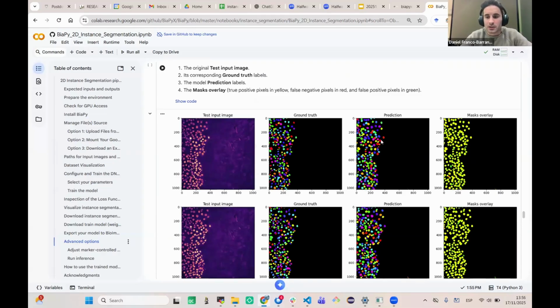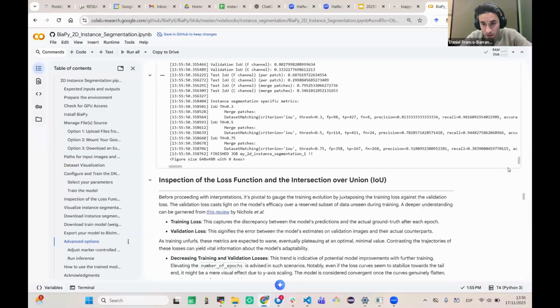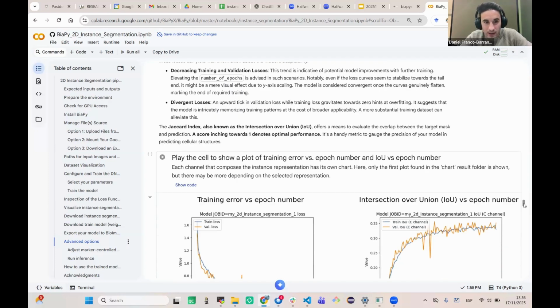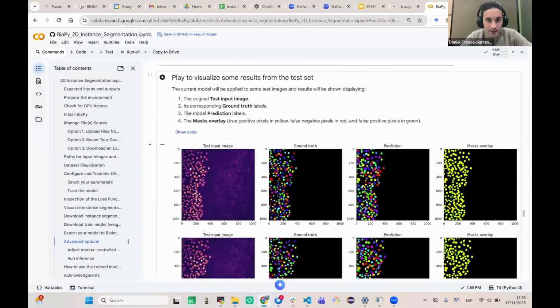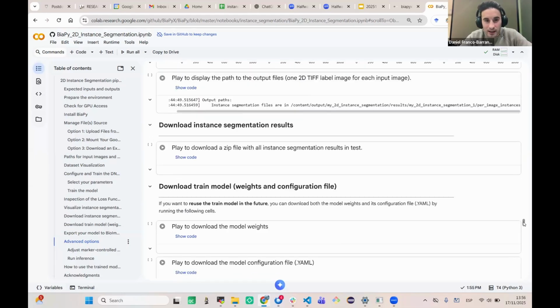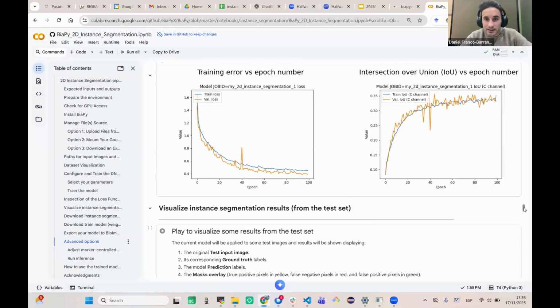So with these last minutes that I have, hopefully, if you were following me, you will have the output of these cells, and you can check by yourself how the model performs in the test data.